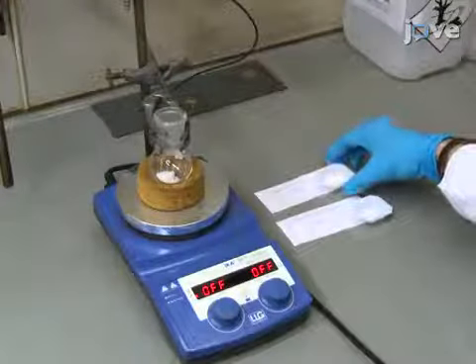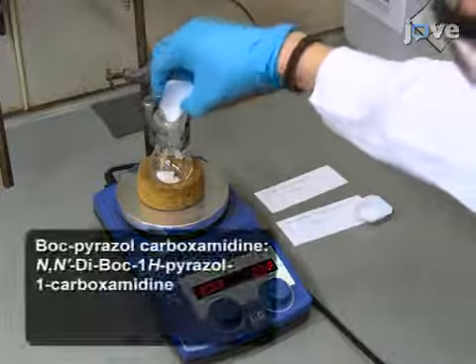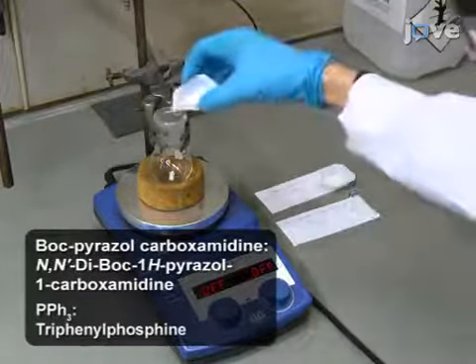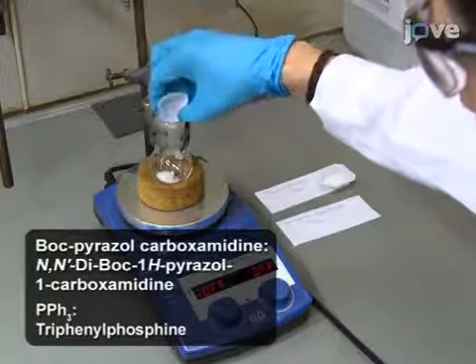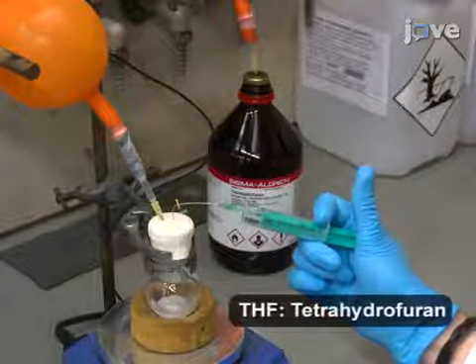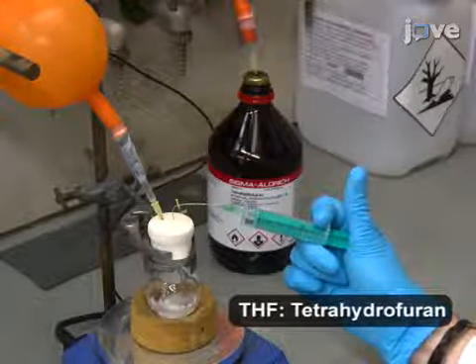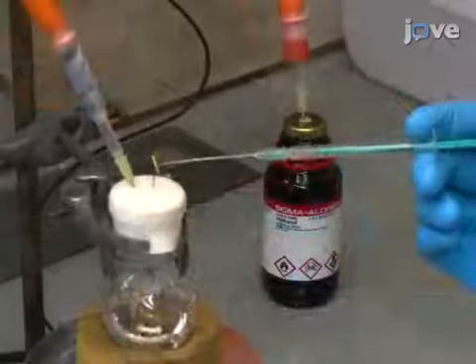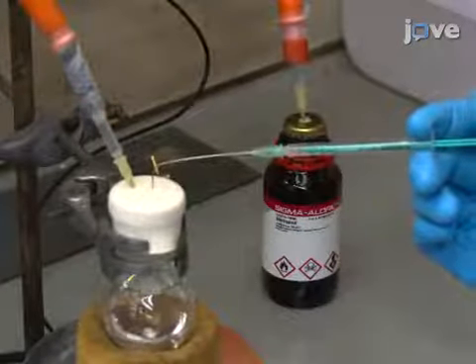To begin this procedure, add 1 gram of Boc-pyrazole carboxamidine and 1 gram of PPh3 to a 50 ml round bottom flask. Subsequently, add 10 ml of dry THF to the flask in an inert atmosphere via a rubber septum. Using a syringe, add 194 microliters of dry methanol.